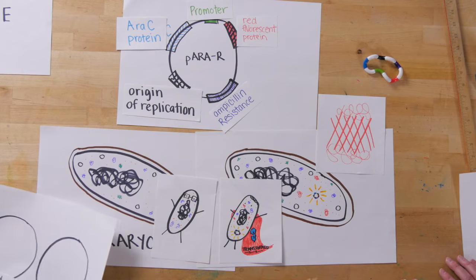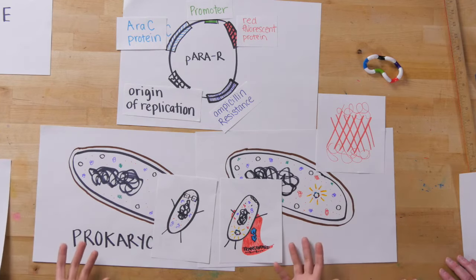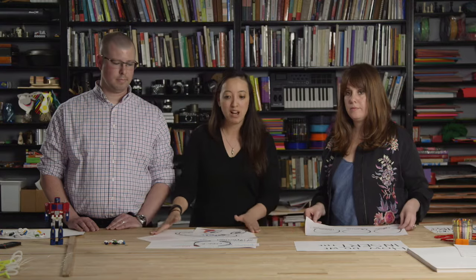Now we want to make a lot of this red fluorescent protein. Our goal is to produce this product. So now we have to grow the bacteria that have the super power. So how do we grow bacteria? One way to grow bacteria is to grow them on plates.